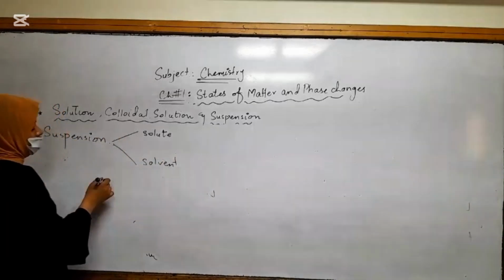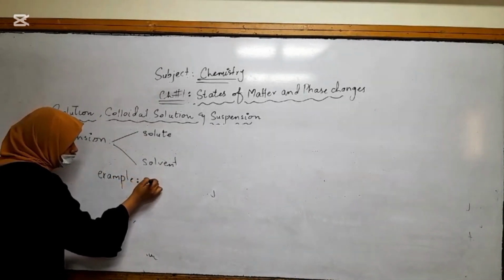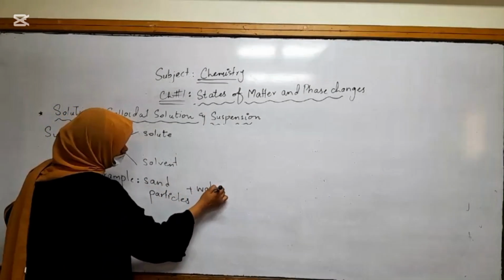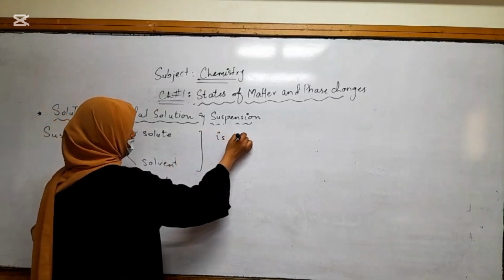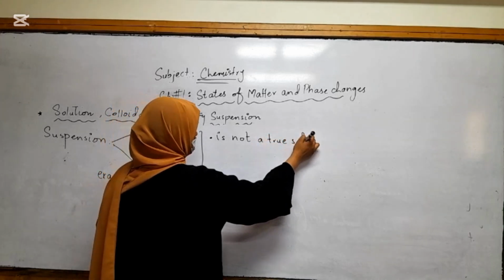Okay. So we are going to form a suspension of sand particles with water. And a suspension is not a true solution.